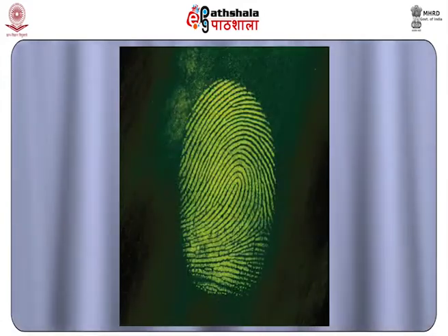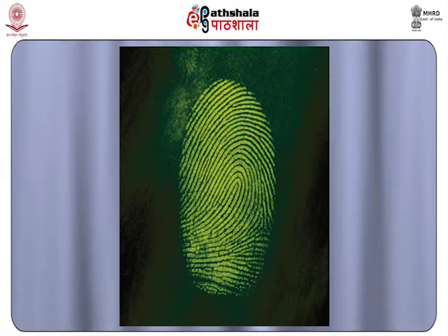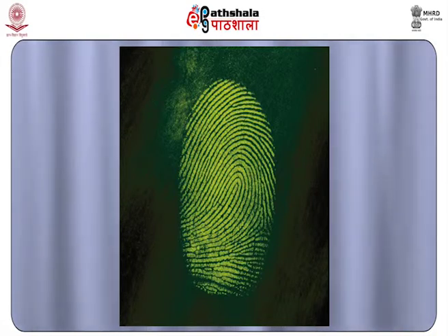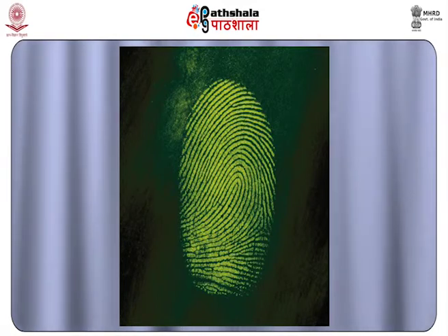A fingerprint developed with DFO is less visible in white light than after treatment with ninhydrin, but with green light, it fluoresces strongly. The fluorescence is viewed and photographed through an orange or red filter.